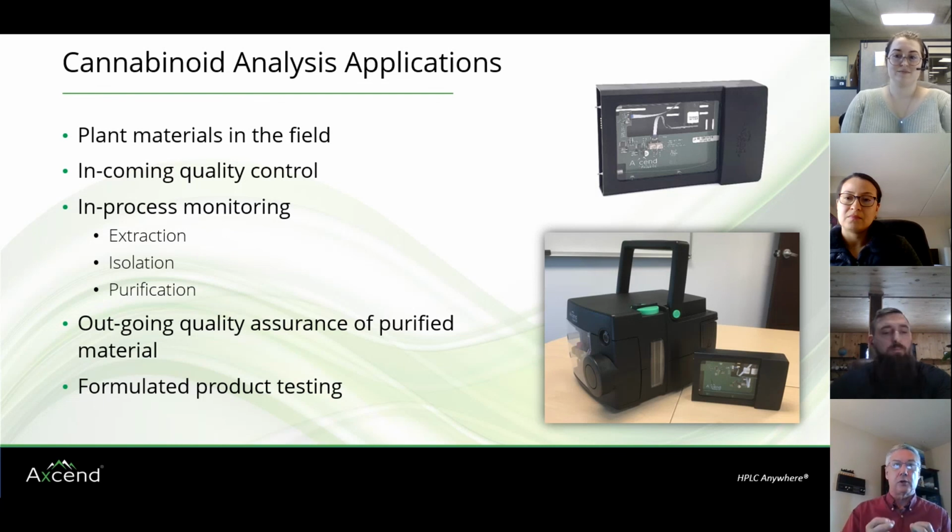As Natalie mentioned earlier, again, we depend on the Restek people for our methods. We work with them routinely. To get the best results, you're always going to have to fool around a little bit with your extraction methods based on the matrix. Natalie did a great job of helping you to see what some of those are. What we can do is help you to optimize your extraction techniques right on the spot.